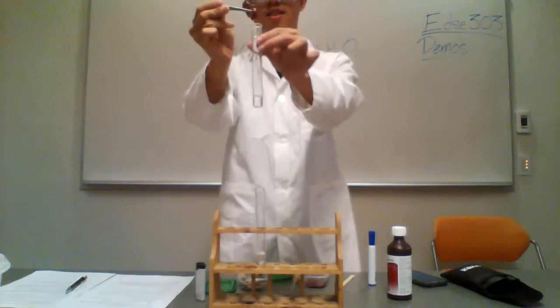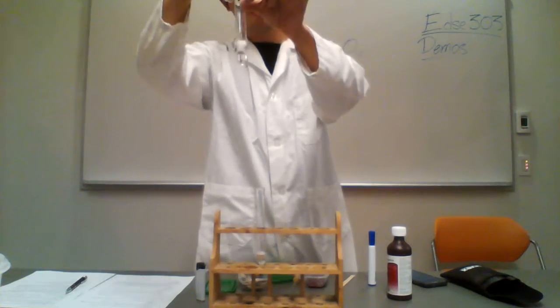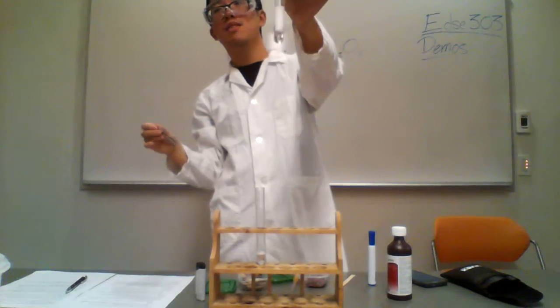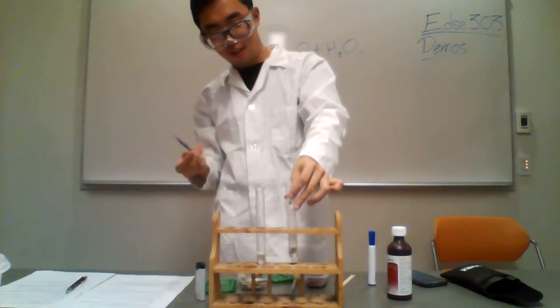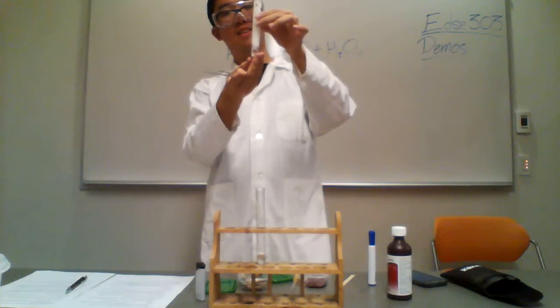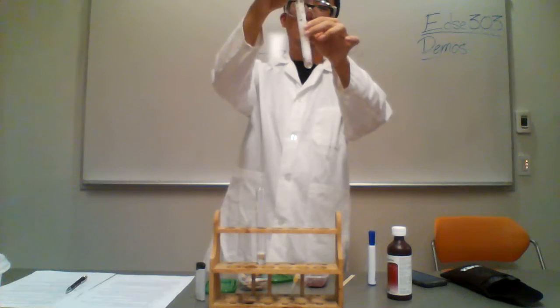Okay, you ready? Oh, just kidding. Whoops. So, you see what's happening? More bubbles. Lots of bubbles. So Cam was right. It's definitely making way more bubbles. Hopefully it does not go over the top. There we go. Just some nice liver bubbles, right guys?